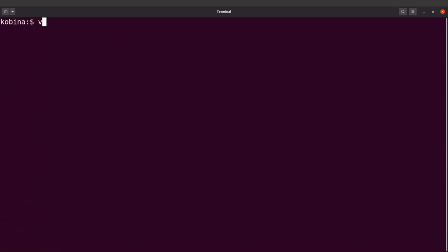So I'll say vcf-query -l. I'll supply my file name. That's for the VCF file. And then I'll use a pipe, and I'll say grep, and I'll say PR like this.